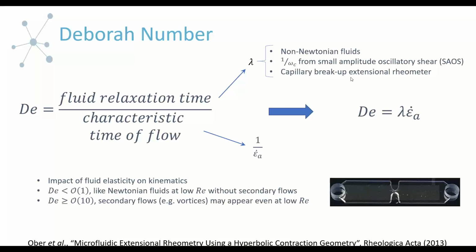Alternatively, if you're doing some sort of capillary breakup, looking at the thinning of a fluid element after it was stretched, and you're monitoring that thickness as a function of time, one of the parameters in the expression there is the relaxation time of the fluid. So it can come from that type of experiment as well.